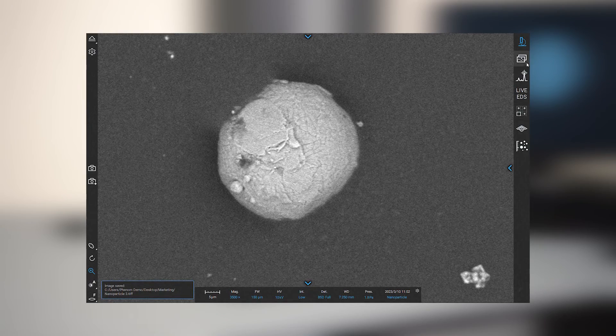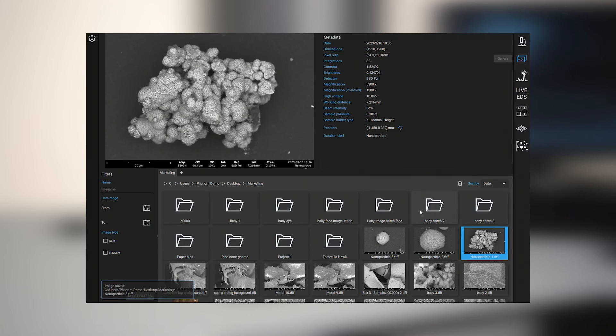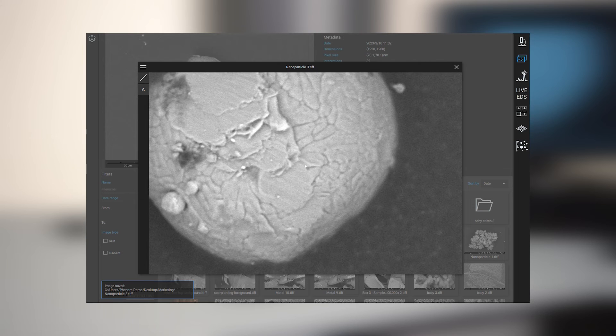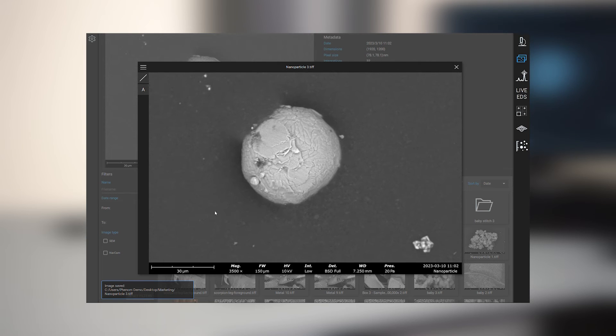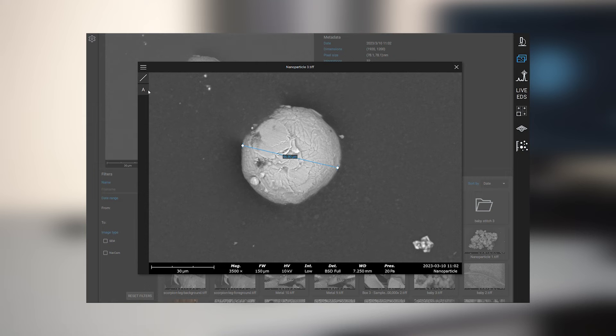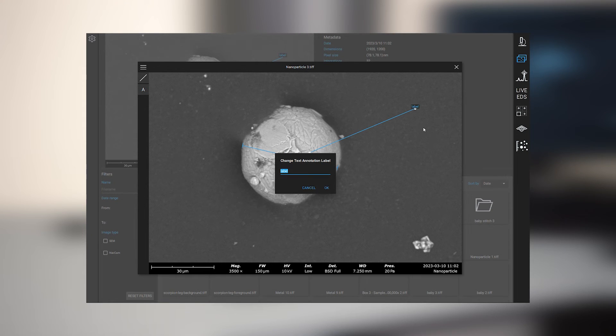I can navigate over, zoom in, and see that nice SEM quality image. And then I can quickly draw things on the screen like measurements and text annotations within the gallery itself.